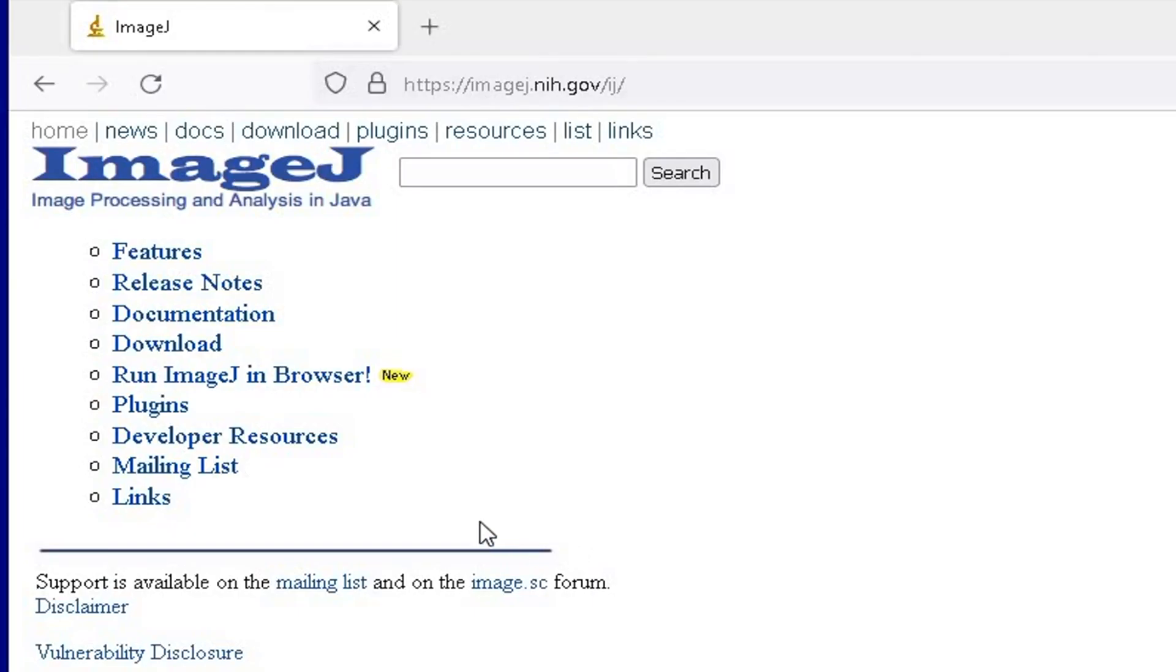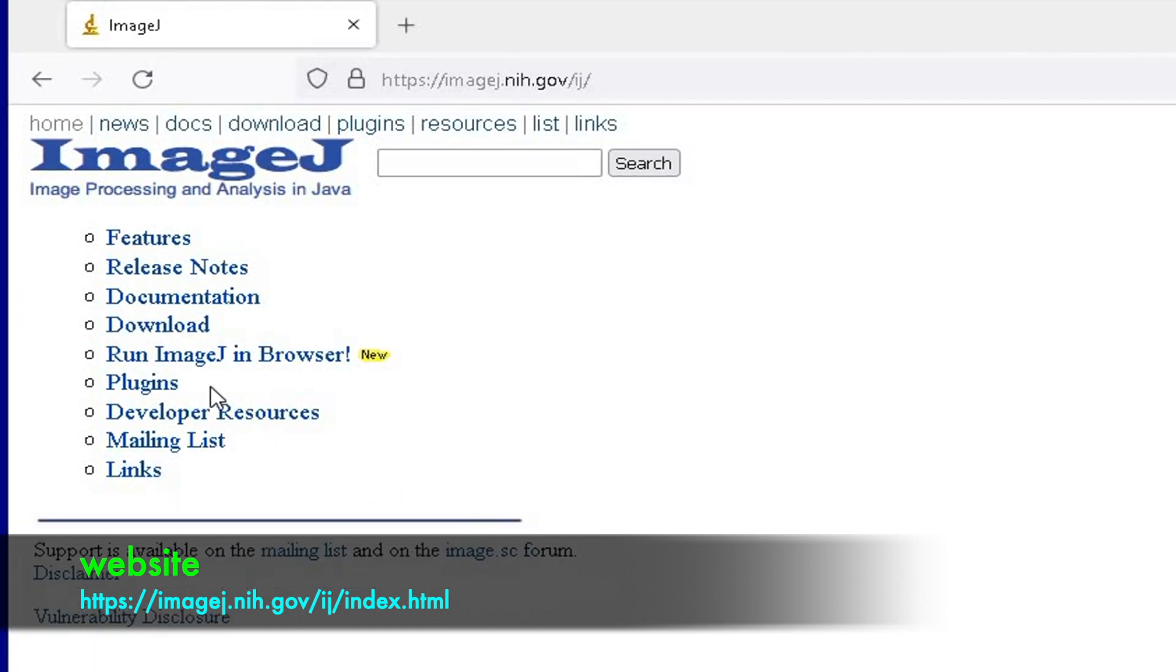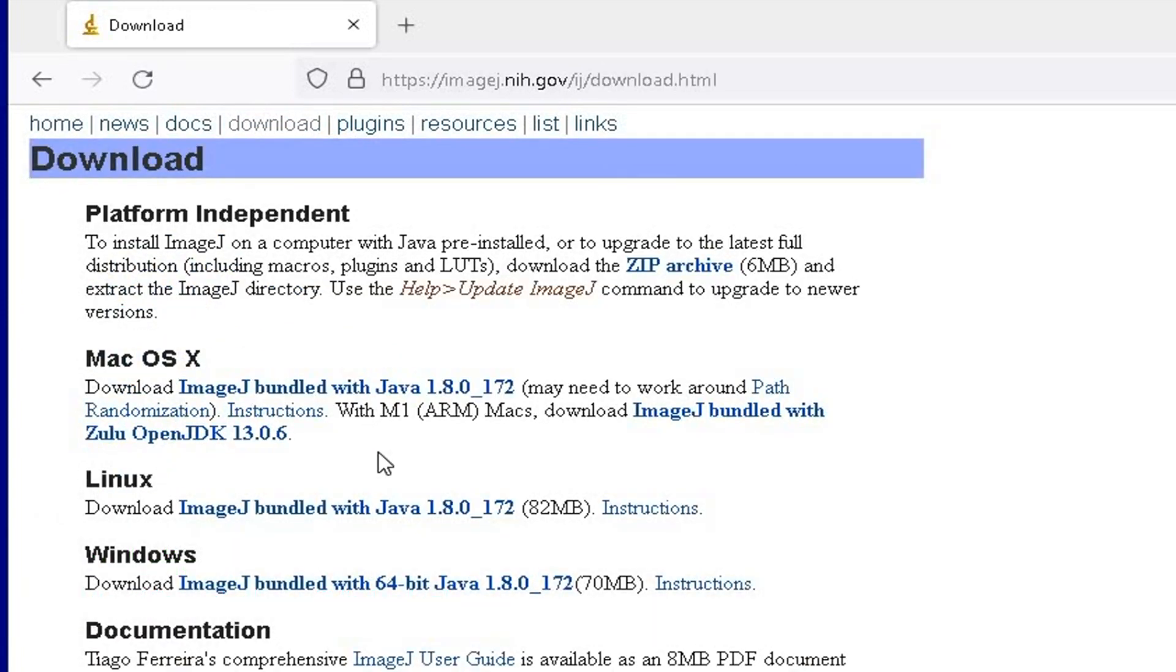To quantify the intensities of western blot bands, log on to the website as shown in the screen below. Click on download and select the software that suits your operating system.